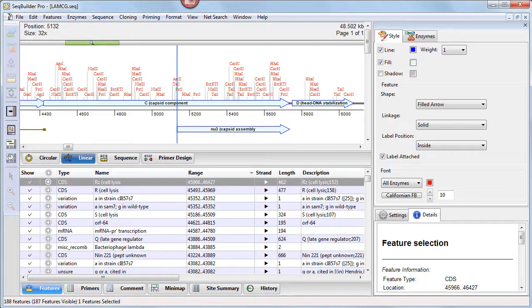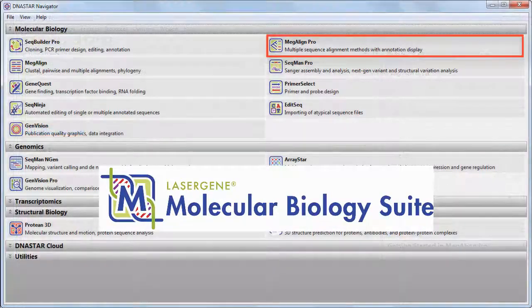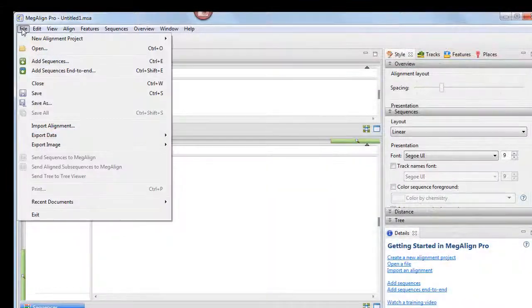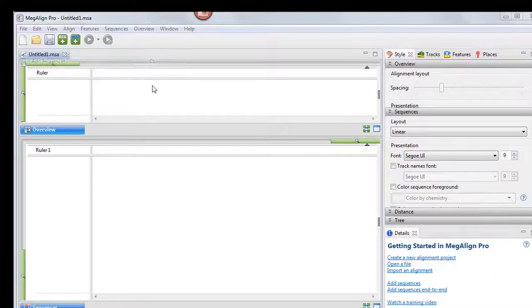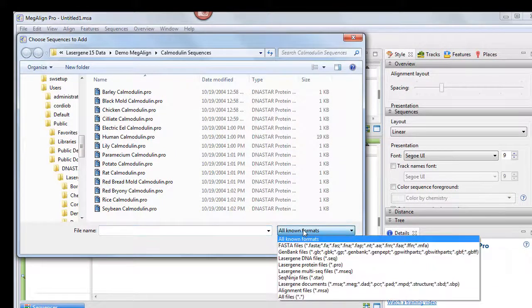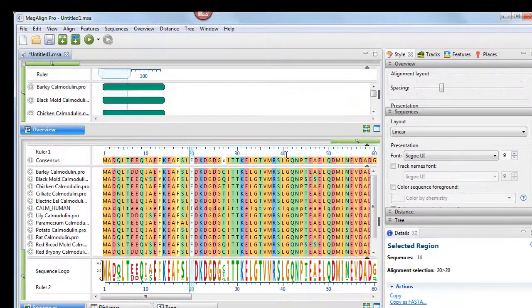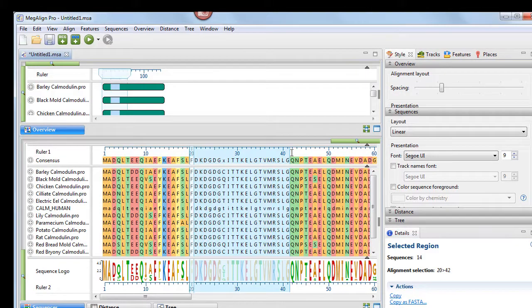Other enhancements to note in SeqBuilder Pro are the ability to directly import SnapGene files, as well as functionality for auto-naming primers. New features in MegAlign Pro include the ability to import gapped FASTA alignments, as well as support for aligning subsets of sequences.